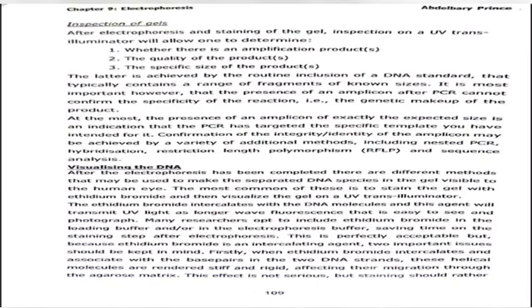Many researchers opt to include ethidium bromide in the loading buffer and/or in the electrophoresis buffer, saving time on the staining step after electrophoresis. This is perfectly acceptable, but because ethidium bromide is an intercalating agent, two important issues should be kept in mind. Firstly, when ethidium bromide intercalates and associates with the base pairs in the two DNA strands, these helical molecules are rendered stiff and rigid, affecting their migration through the agarose matrix.